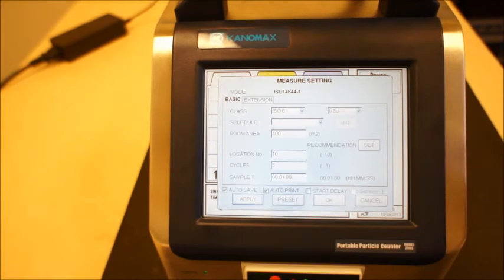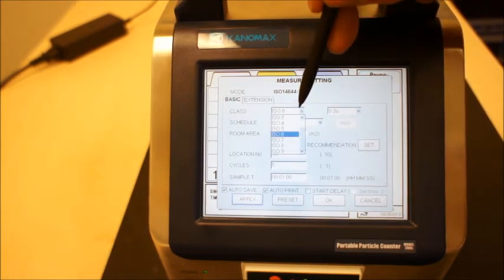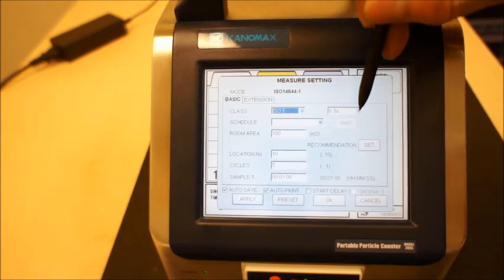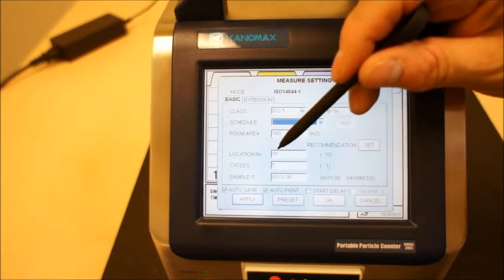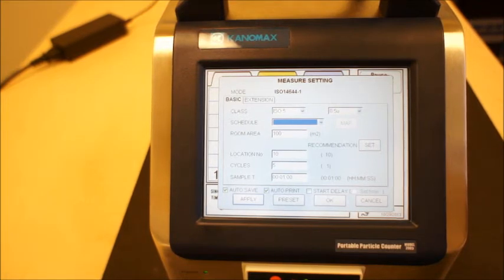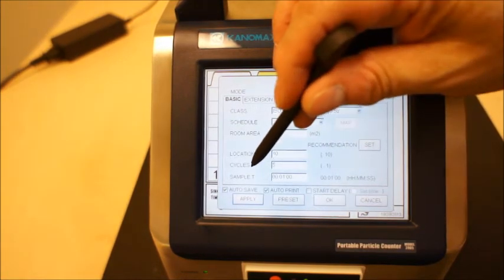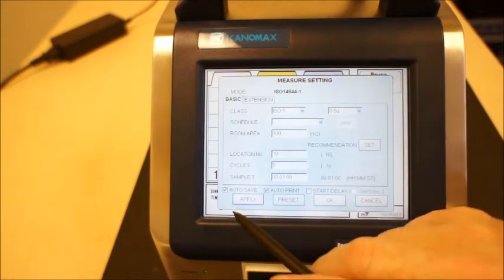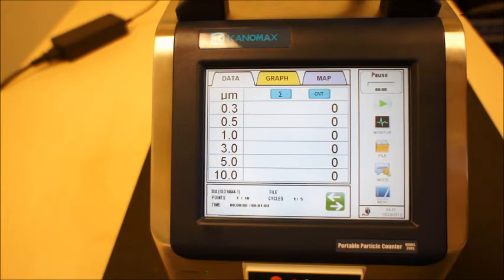You have the option to measure in ISO mode. For example, using the ISO 14644-1 standard, you can actually enter the class of the room that you want to measure in. You can set the individual particle size, room area size, and locations. In this mode, you can set this with a map so that each location will be notated, and when you reach each measurement location you can set the instrument to measure at that location — it will store that location indicatively. You set the cycles, how many cycles and how many samples you want, and then you just hit apply and it will store that. Then you're ready to actually do the measurement.